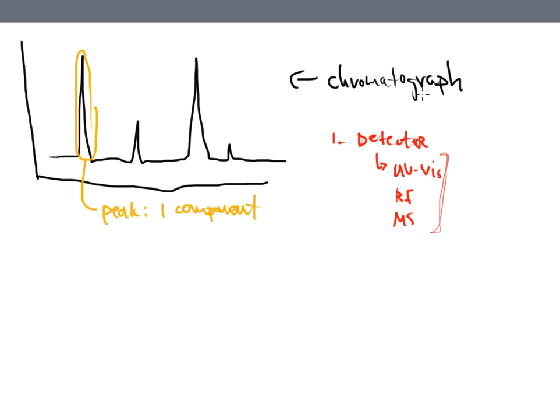All right, so this is a chromatograph. These are called peaks, and the peaks are picked up by the detector that's on the machine. And there could be many, many others, right? Those are not just the only ones, but there's tons of different versions that are out there. Now, if you've looked on the graph, the chromatograph, we're going to have a starting point, and this is at 0. The axis down here on the bottom is in the unit of time, okay?